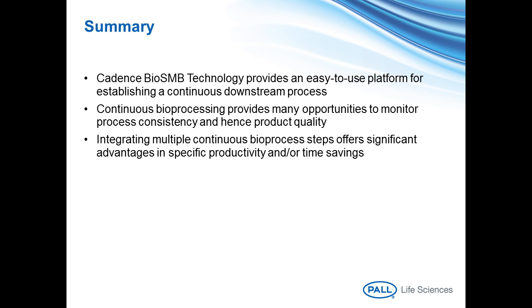But on the larger GMP scale, we have a different solution. And it's not ready for launch yet, but we're working on a solution that will probably mimic the batch process, where we pool a few elutions, and then we'll carry on and do the VI process on those few elutions, and we'll have a semi-continuous approach to VI.